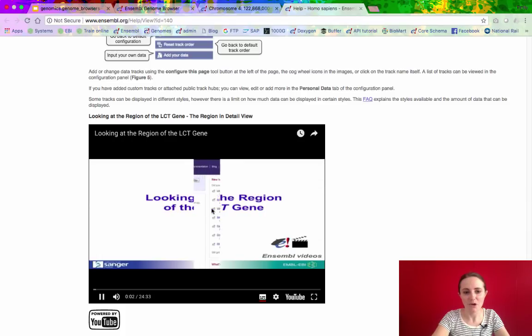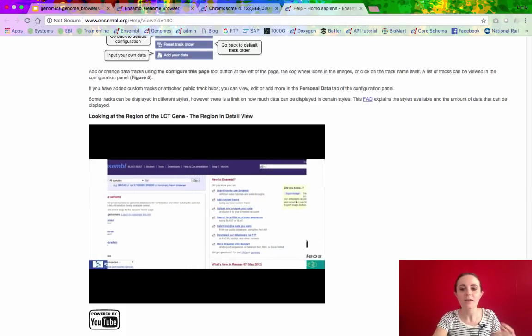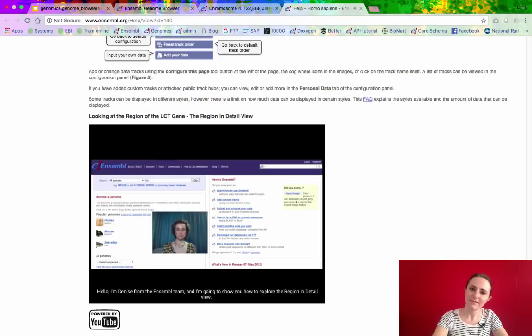What you'll see in a moment is Denise, who used to work for our team, giving you an intro. Hello, I'm Denise from the Ensembl team, and I'm going to show you how to explore.